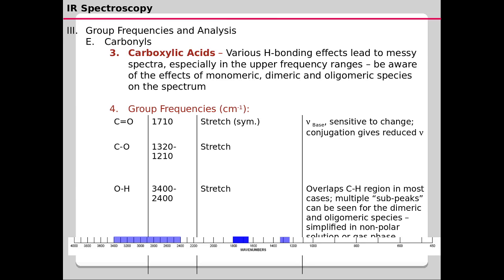Okay, so the carbon oxygen stretching frequency can be found around this typical value, and again this should be taken as a base value because it can be reduced by means of conjugation effects when the carbonyl functional group is bound to a C double bond C, such as the one in a vinyl system, or the C double bonds in a phenyl aromatic system such as a phenyl ring.